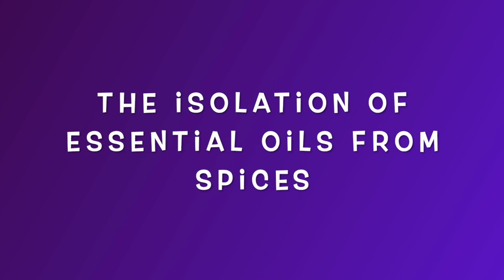Easy peasy. There you have it, the isolation of essential oils from spices. This lab is one of the only times the organic chemistry lab smells good. Enjoy!